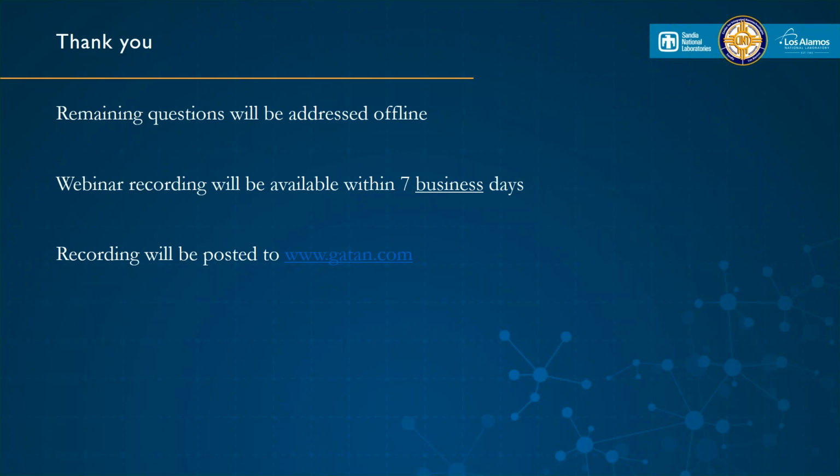But I think if you look at the ruthenium one, which is the one that you did, Ben, you can see that somebody with a lot more knowledge and experience with GMS than me is able to get those regions of interest to sit firmly square in the middle of the video. So, you know, I'm still learning all the tricks on how to do it. So some of the ones from 31 to 33 are perhaps my first crack using the tools available. But some of the ones, particularly, I'm not sure the slide number, but the ruthenium branched one, which Ben, you did, you can see that you can get that video to sit firmly in the middle without drift.